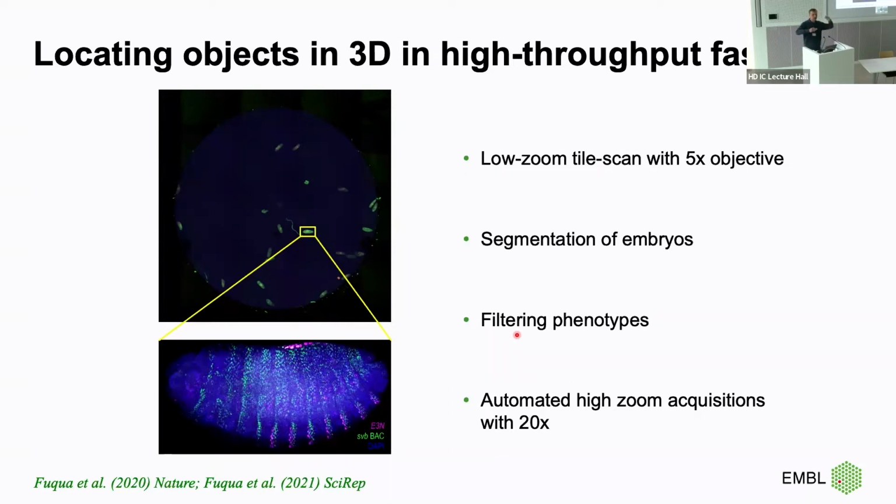So what we realized: the sample can be mounted at different heights, right? Because depending on how it's mounted, maybe not all embryos are perfectly flat. So not only do you want to select in XY, you want to select in Z. If you want to select XY and Z from the beginning, you have to sample the sample in high 3D resolution from the beginning. What would be the advantage instead, right? Could we actually separate the decisions? Can we decide on defining the XY location at once, and then focus on this embryo and define the Z location? Another point, of course, if you are on a point scanning confocal microscope, do we need to image always the bounding box, or can we also adapt the rotation of the field of view, for example, and such kind of thing?